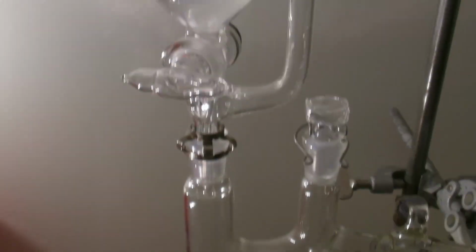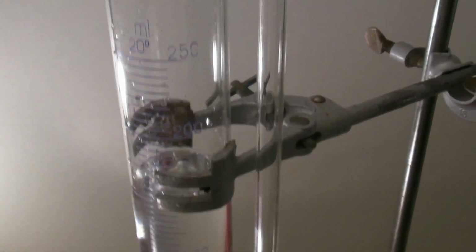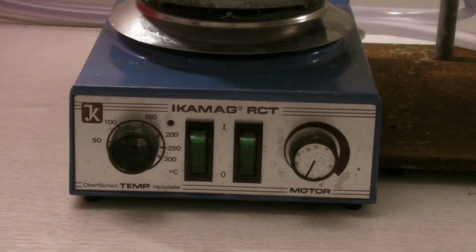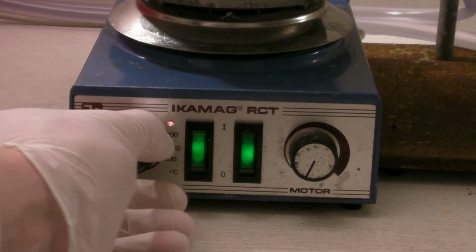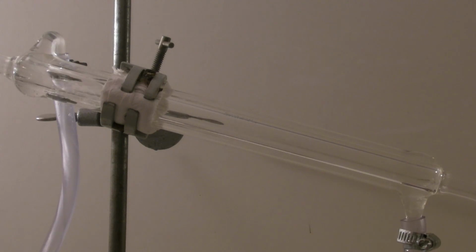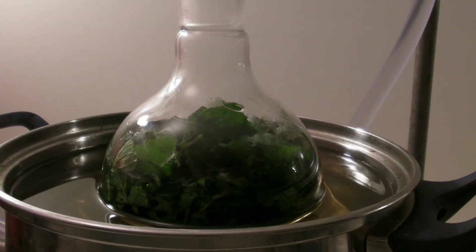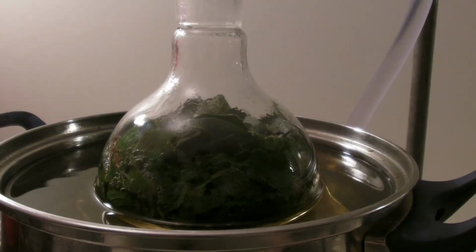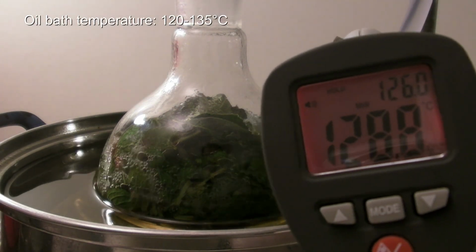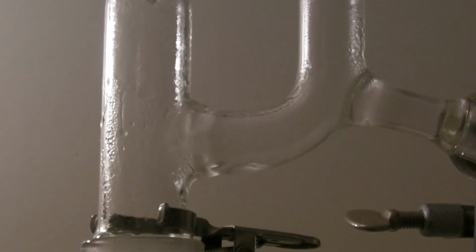Then a simple distillation was set up with a dripping funnel filled with distilled water on top, so water can be added later on and the distillation doesn't have to be interrupted. The oil bath was then heated until the water in the flask began to boil. The temperature of the oil bath was kept between 120 and 135 degrees C. After about 20 minutes the distillation began.